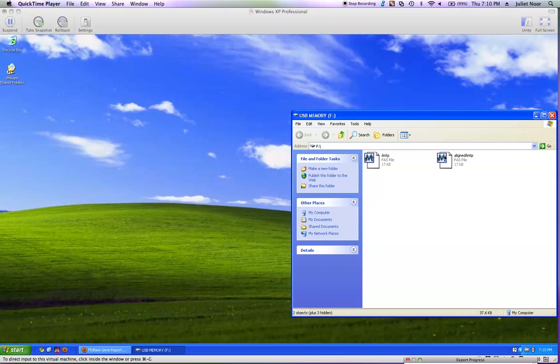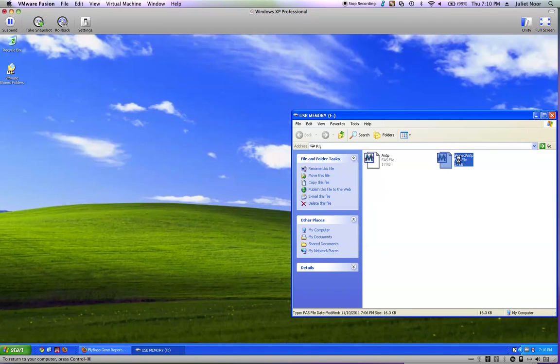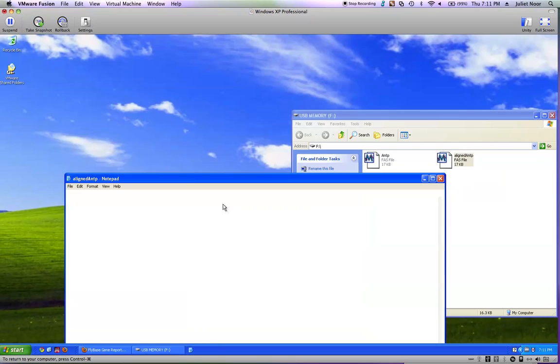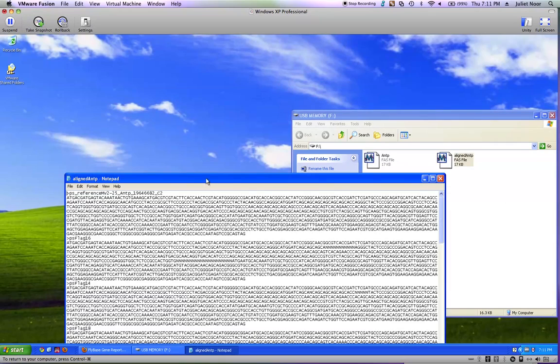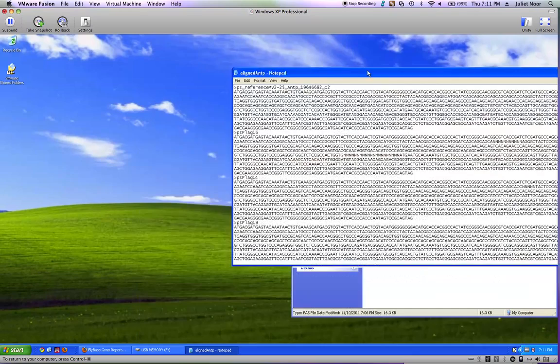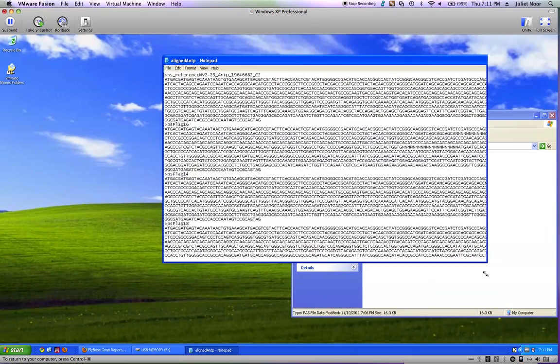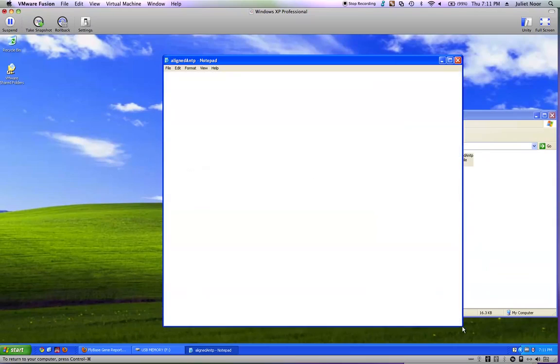The next step is to open this file in Notepad. I right-clicked, scrolled down to 'Open with', chose Notepad, and it opens just like a text file. This one is nice and easy to read. I'm going to make it a little narrower so there's room for another window next to it.